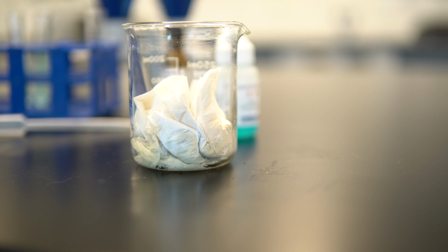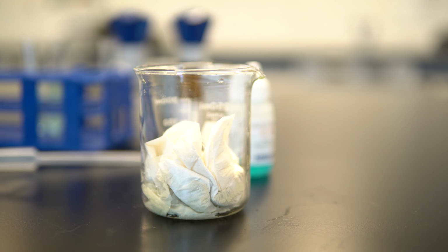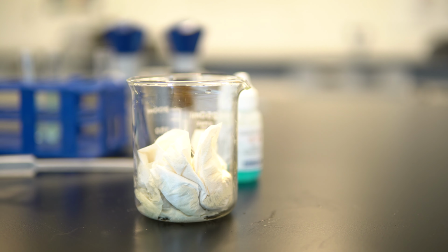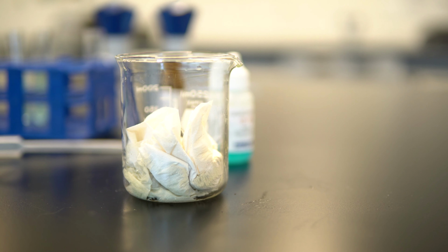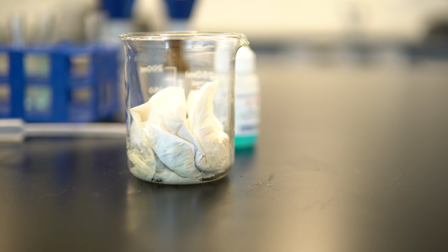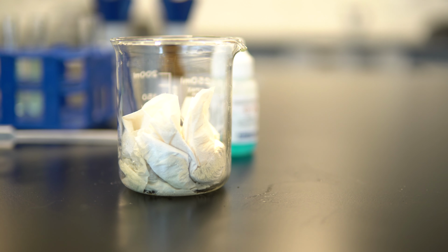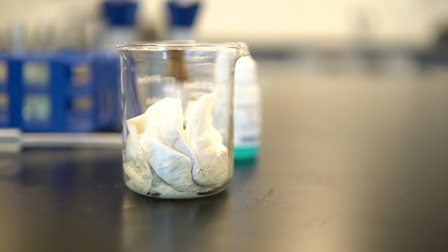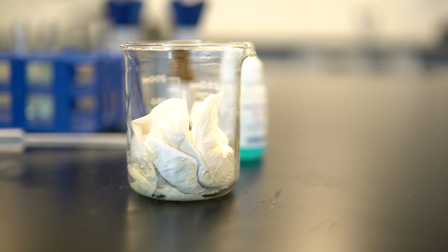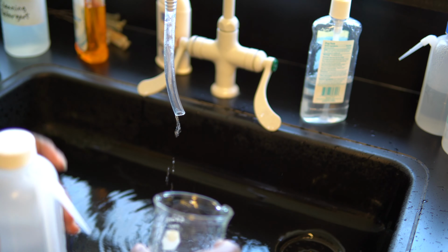Mix any remaining silver nitrate solutions with a few milliliters of sodium chloride solution. A white precipitate of silver chloride will form. This can be absorbed into some paper towels and disposed of in the trash. All reaction solutions not containing silver nitrate and remaining copper chloride solutions can be poured down the drain with running water. Allow the faucet to run a few minutes to dilute the solutions.